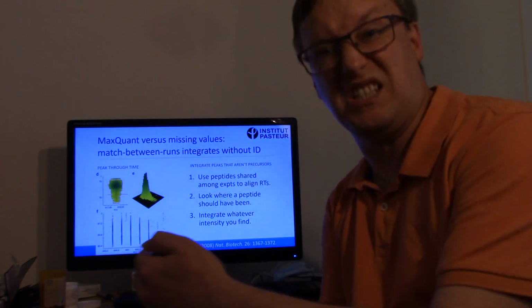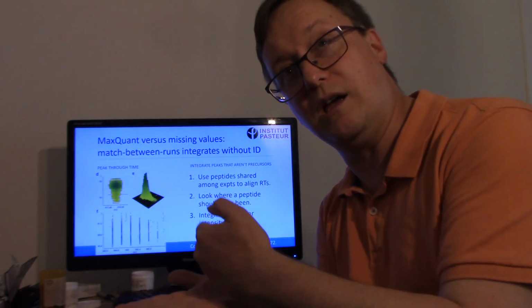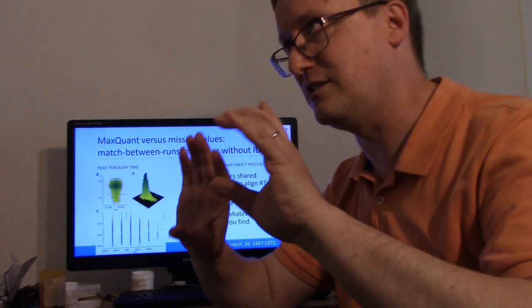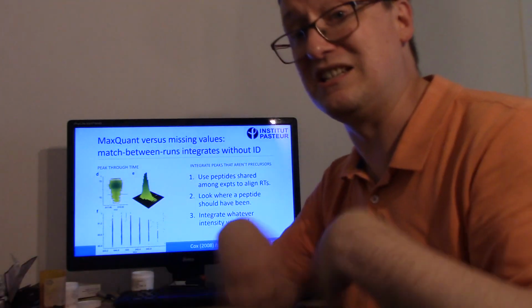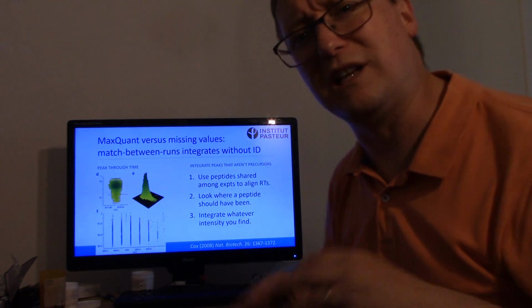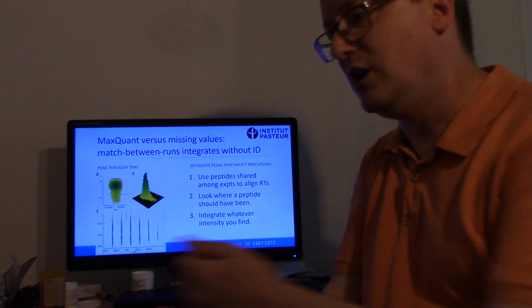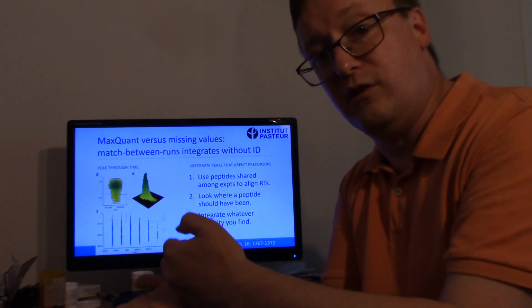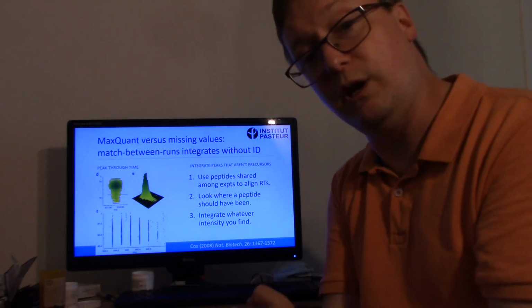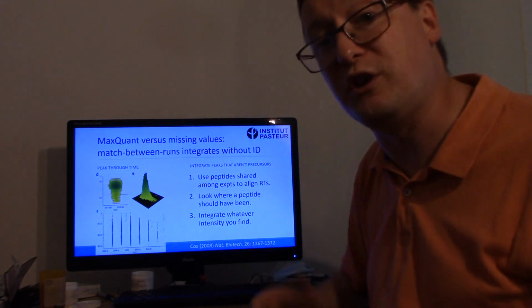We have what we call the C13 or M+1 peak, which represents a molecule in which probably one of the carbons is a natural heavy isotope of carbon. So I think that if I remember the numbers correctly, something like 1% of all carbons in the world, on Earth anyway, are carbon 13s. So some fraction of the peptide molecules have an extra neutron, or an extra 2 neutrons, or an extra 3 neutrons. And the spacing at which we see them in the m/z domain tells us what their charge is.